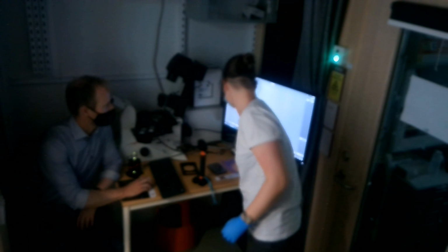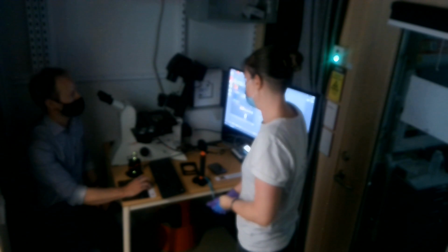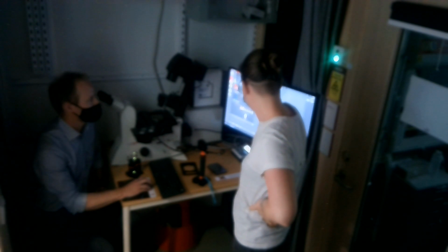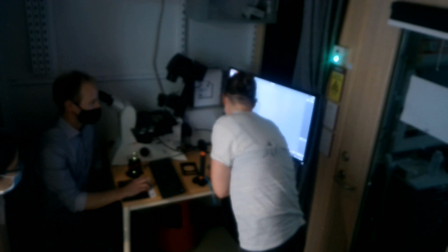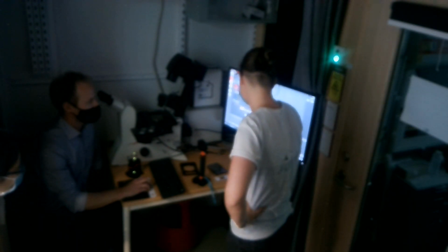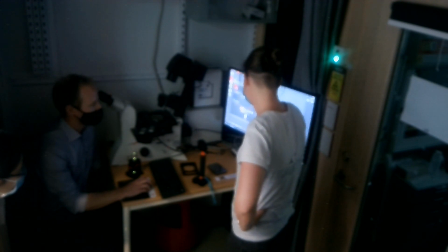So what fluorophores do you have in there? Only one. It excites at 360 and emits at 520. Okay. So in this case, as we talked about before, we will use this cube, which is the multi-bandpass cube. We will excite it as far blue as we can, which will be at 385 with this filter. So it's basically using the DAPI. And because it's a multi-bandpass cube, even though we excite there, we'll also see the emission between 506, 532, 578, 610, and so on and so forth. So this one should work. It worked during the demo. So we'll test that.